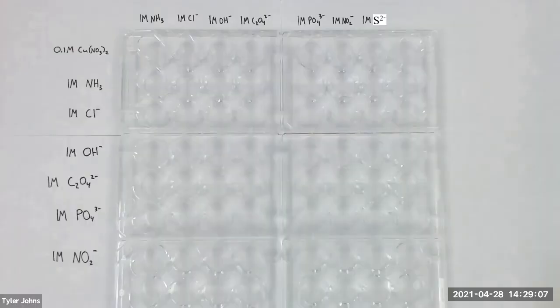We will begin by adding one milliliter of 0.1 molar copper-2 nitrate solution to the first six wells of the top row of our well plate configuration.